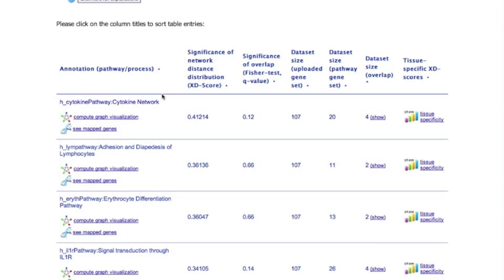The next three columns show the pathway and gene set sizes and their overlap. Finally, the last column provides tissue-specific adjustments of the network similarity scores.